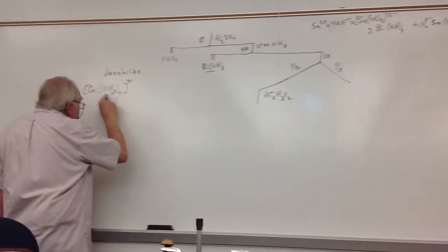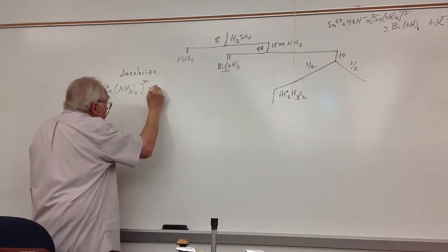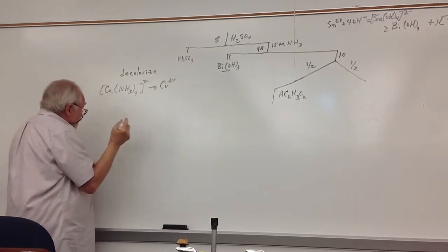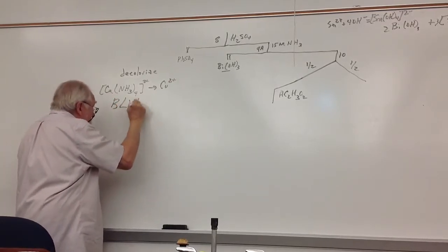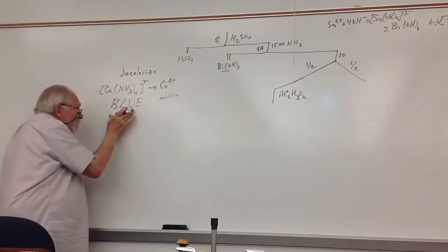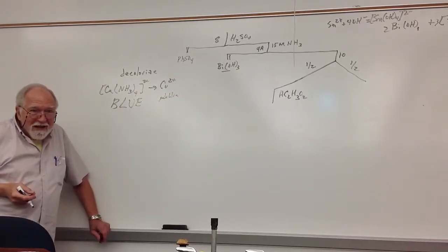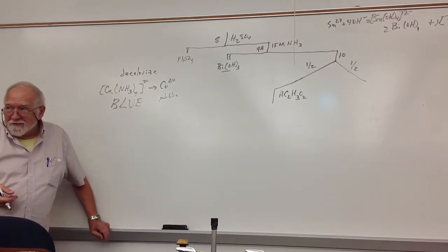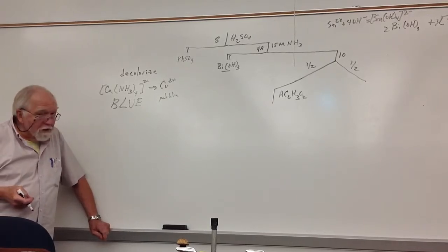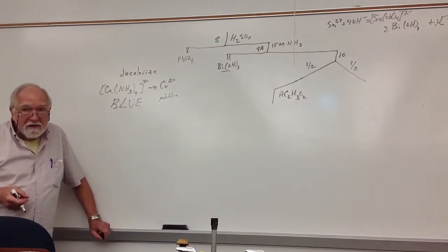When you make it acidic, this goes to the ammonium ion, so it breaks down the complex, so you get copper. This is blue. You can't read this because I made it really small. That's pale blue. So it doesn't get colorless, which is what people would think when it says decolorize. Okay? So it just goes from a darker blue to a lighter blue. That's what he means by decolorize. That tells you you added enough acetic acid.